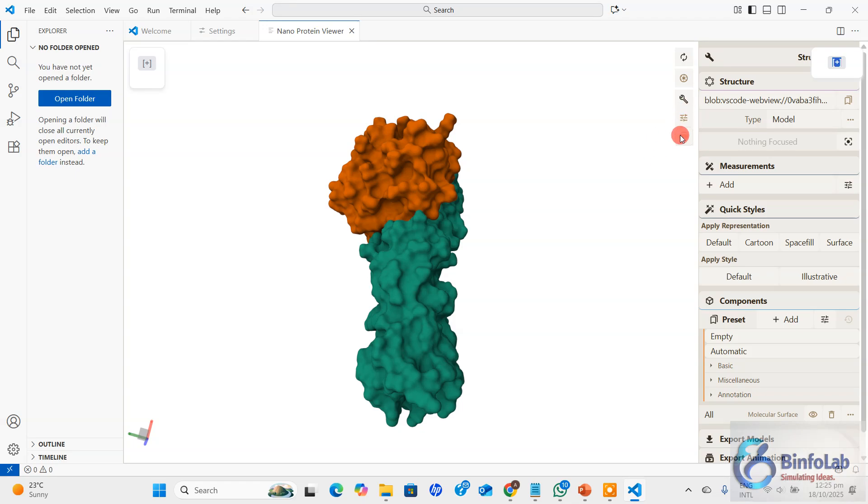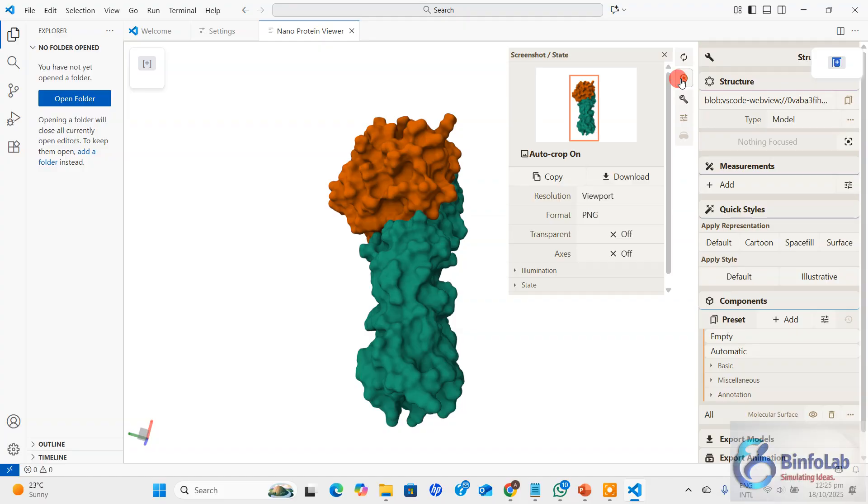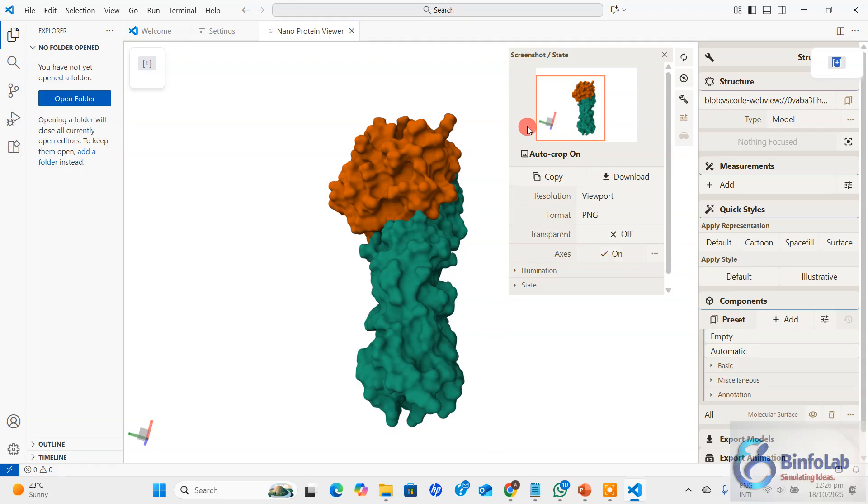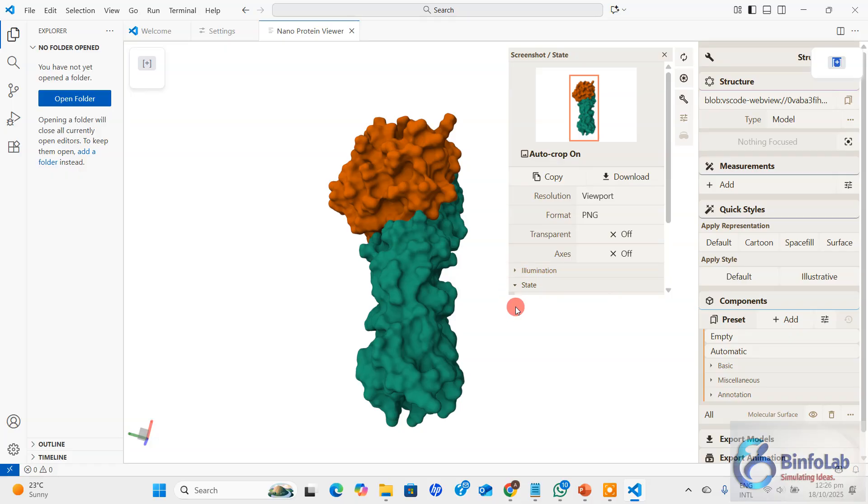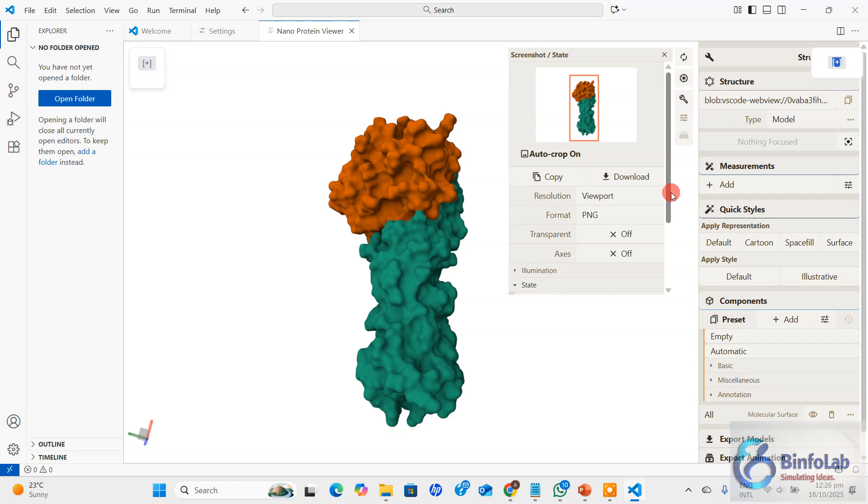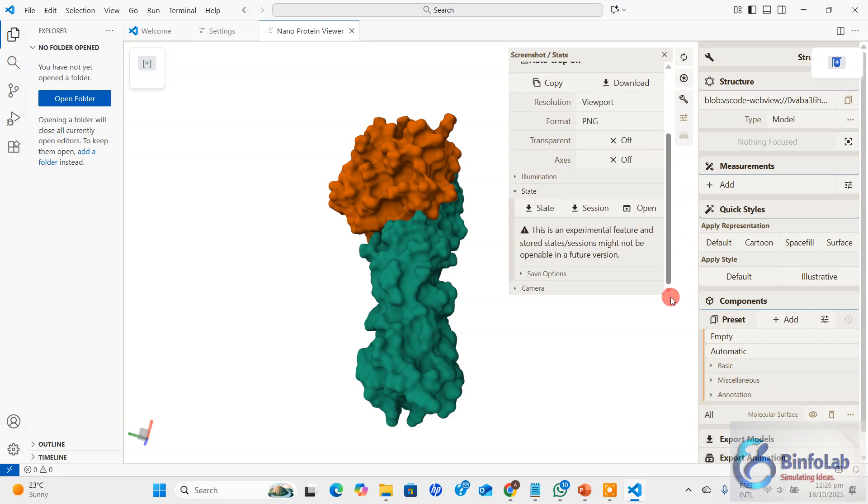Finally, let me wind up this video quickly. This one is the last option. Let's say I'm going to take a picture of it, a snapshot. Just click here and you will have a viewpoint, a resolution, PNG transparent background or not, axes you want to be included or not. It also tells you what state you want to save.